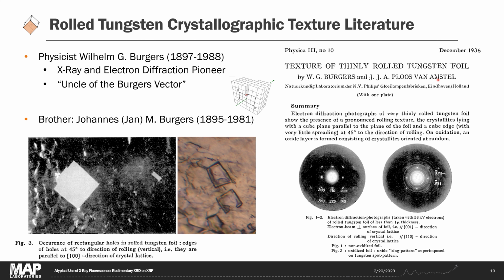He did a crystallographic analysis similar to our X-ray diffraction, but this was electron diffraction done in a TEM. He observed the same effect, that these crystal structures were aligned with their 200 face of the cubic structure parallel with the specimen surface.